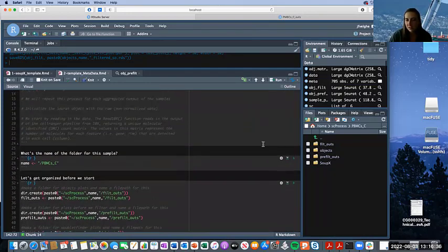Okay. Does anyone want to comment or discuss different filtering processes or things that they've seen at all? Because it really is kind of a big debate. We're all pretty new.